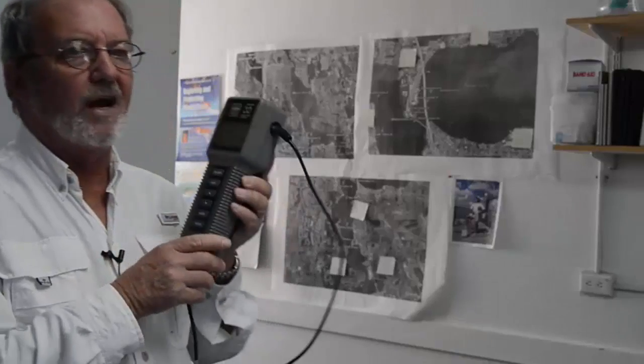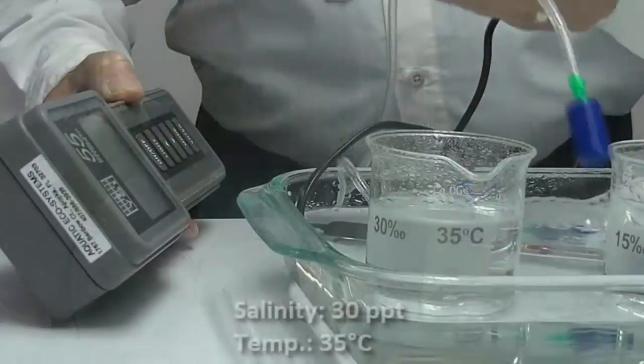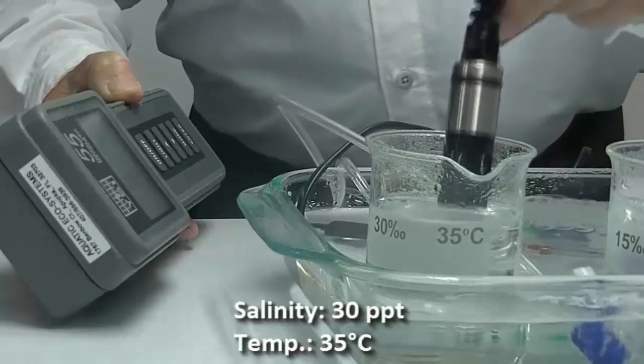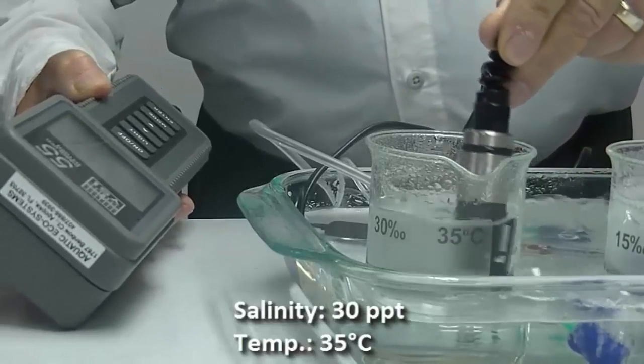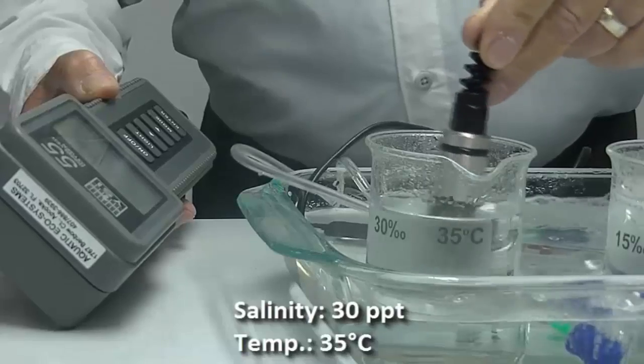So now we're going to take a dissolved oxygen meter and this is called a YSI 55 dissolved oxygen meter and the degree of current that passes across, the amount of electricity, is a measure of the dissolved oxygen in the water.